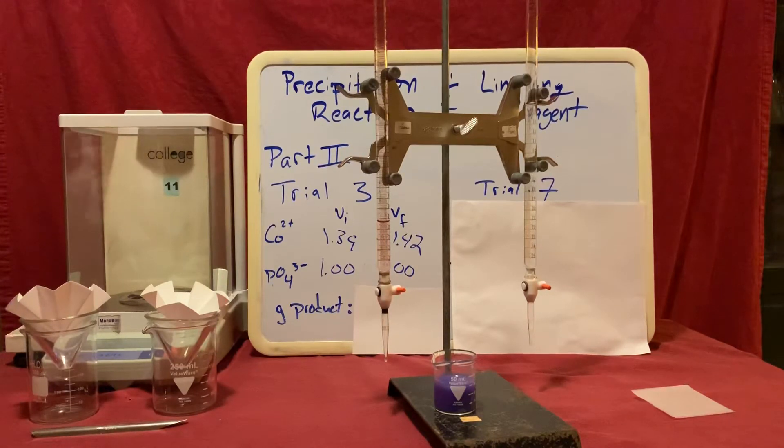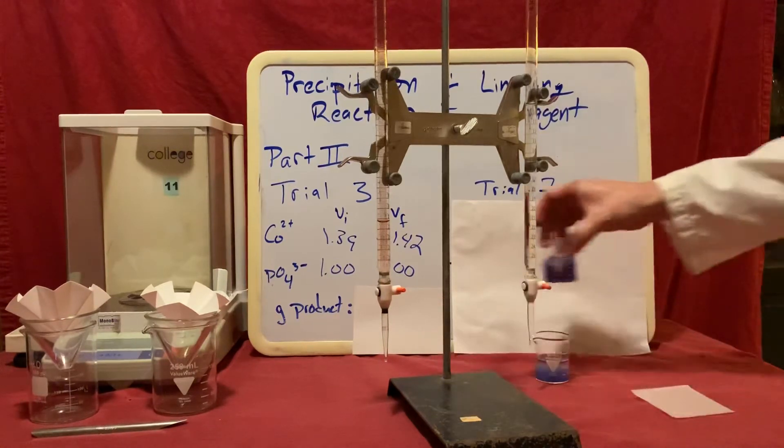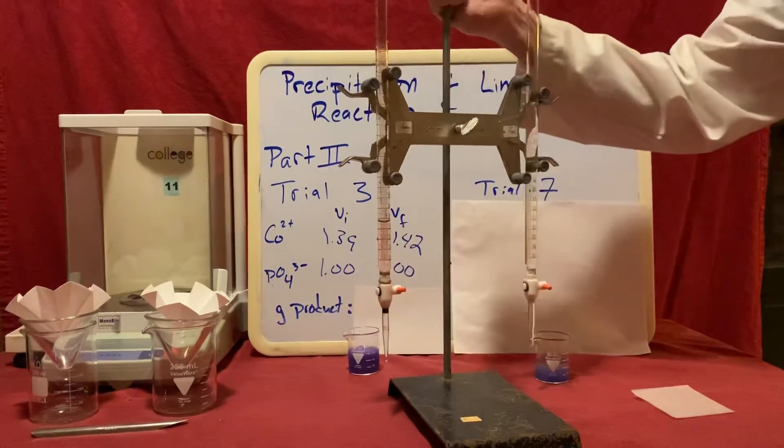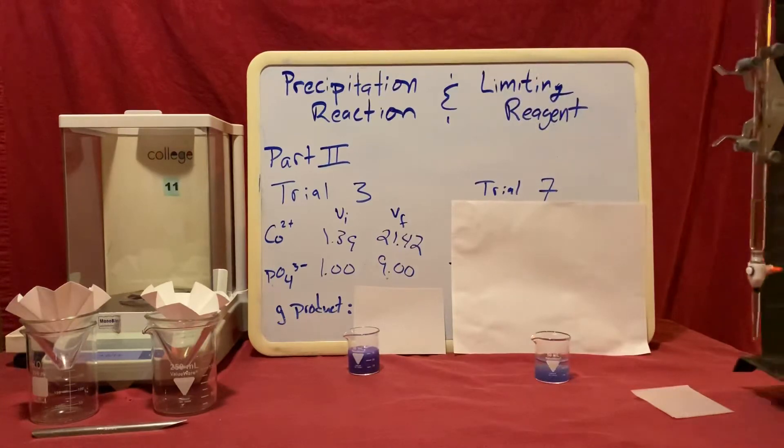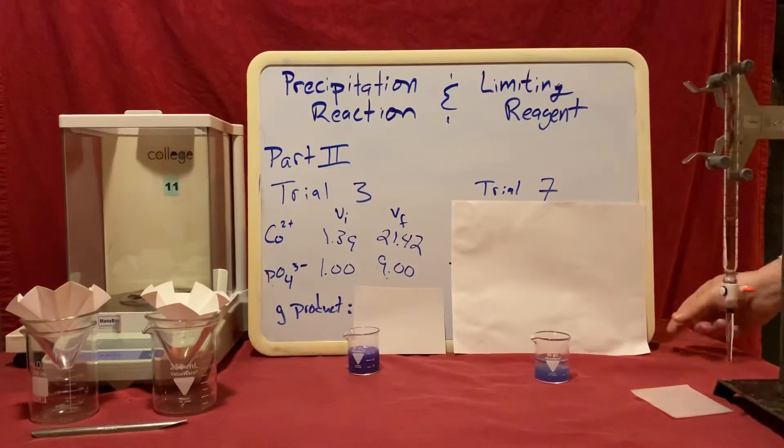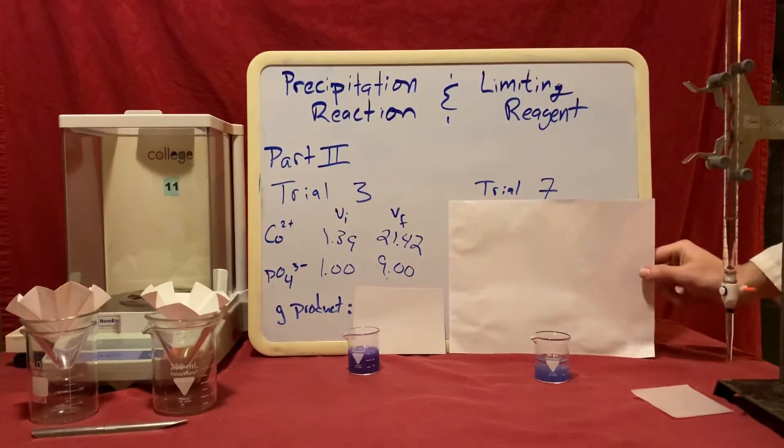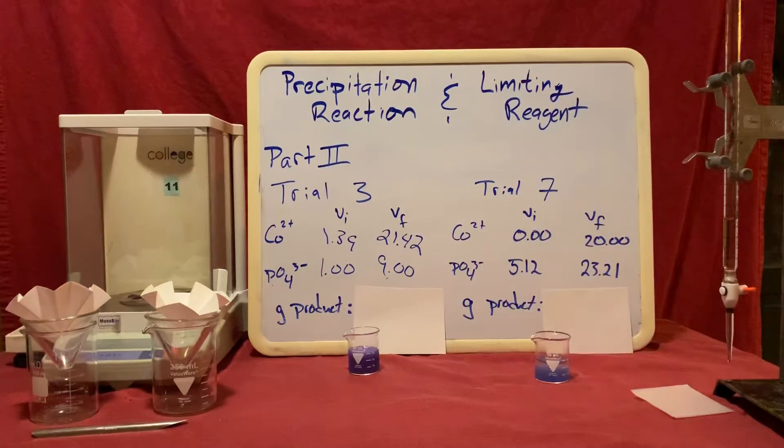Instead of making you watch me do that again for our trial 7, I have prepared a trial 7 sample. So now we have one for trial 3 and one for trial 7 and we are all finished with our burettes. You can see here the initial and final volumes for trial 7 that I collected.